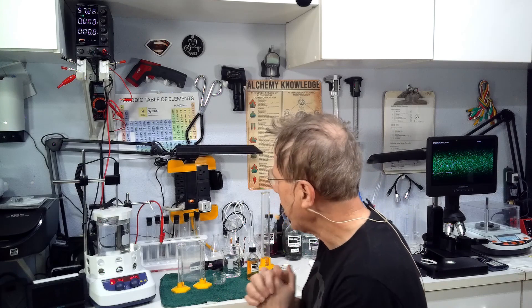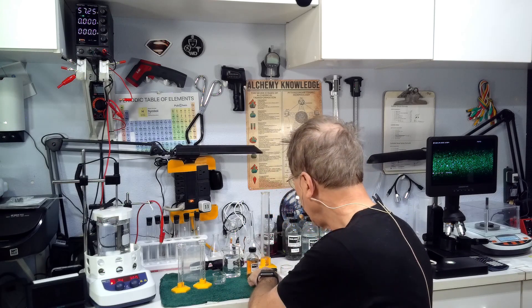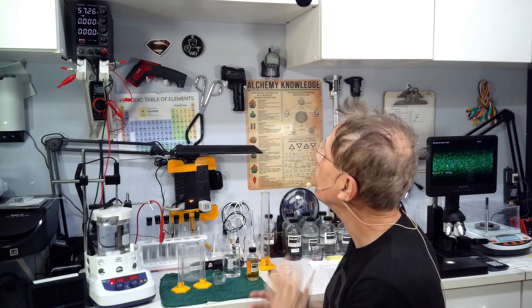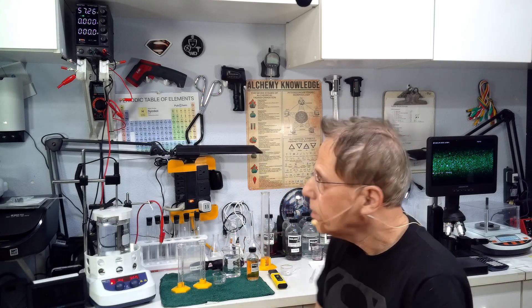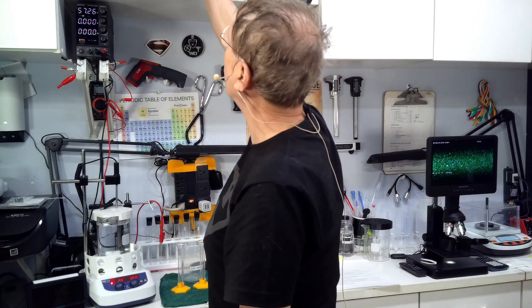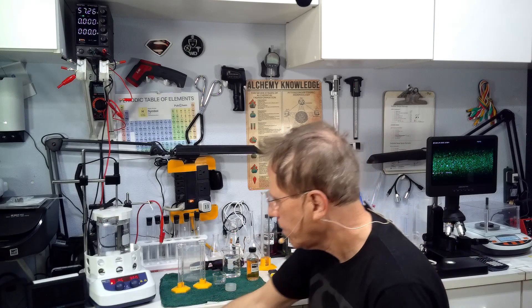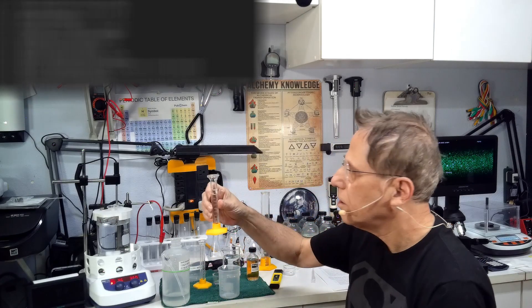We will need 1.5 amps or 1500 milliamps to cook this solution. You've got to put the chemicals in and make sure you got your pH meter handy too.